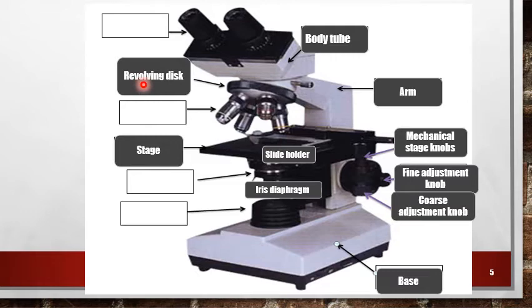Revolving disk is used to move the objective lens from one to another, for example from 4x to 10x or from 10x to 40x.